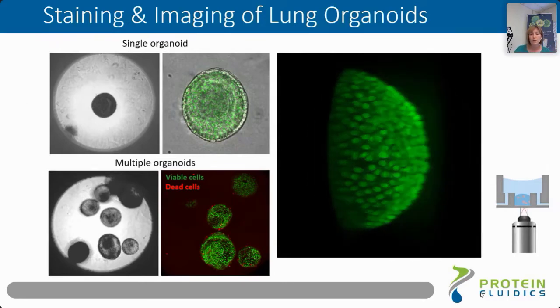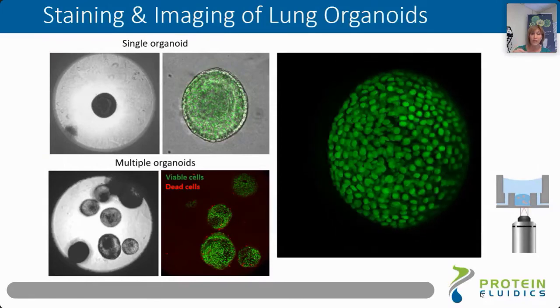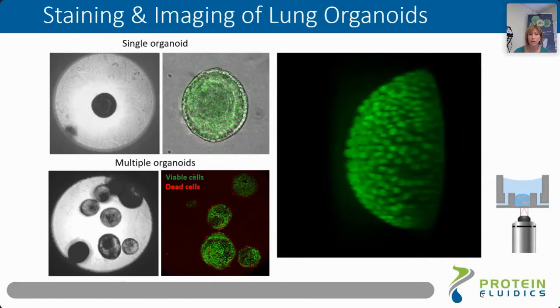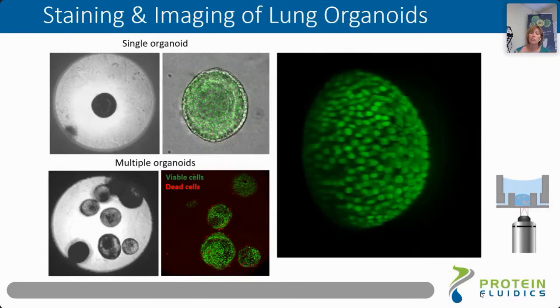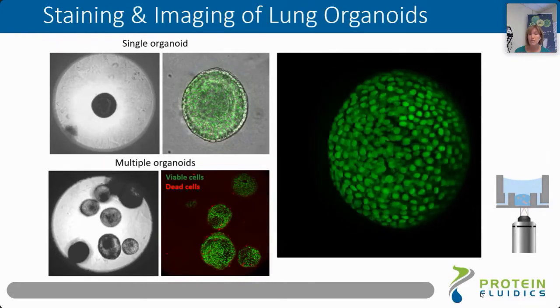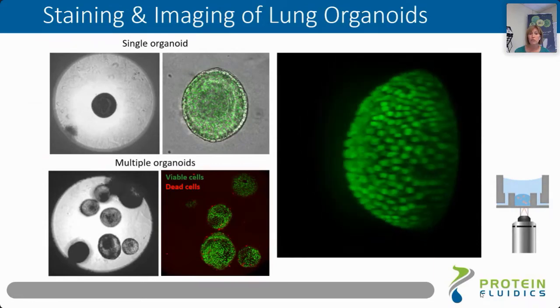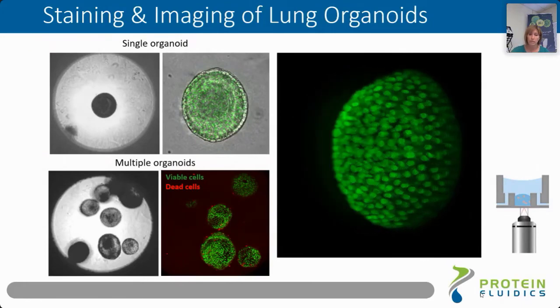They are suspended inside the Matrigel and positioned at different levels. And here's an example of how, with our Z-Stack, we were able to capture 4 of them. You can see that they very well maintain their shape. They are very well protected in the chamber. They are stained pretty well. And I'd like to point out how nice these images look and how great the quality is, so that you can really identify every single cell as a separate object. And that is very important for the downstream image analysis and to get high quality data.